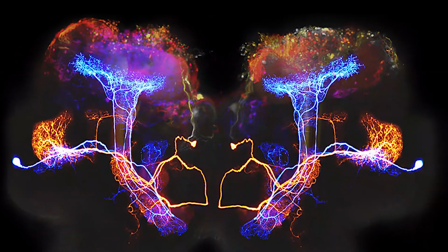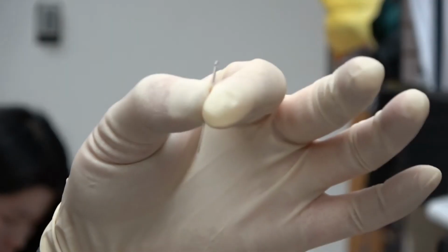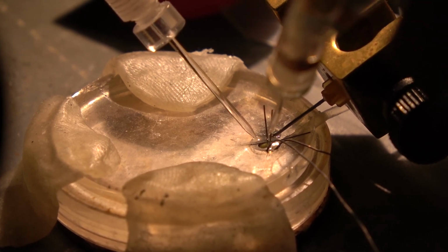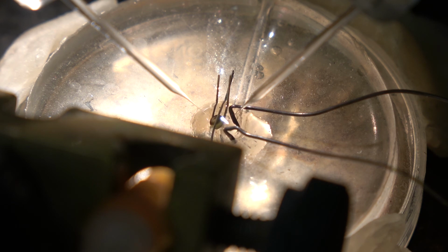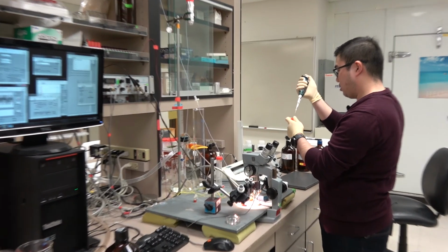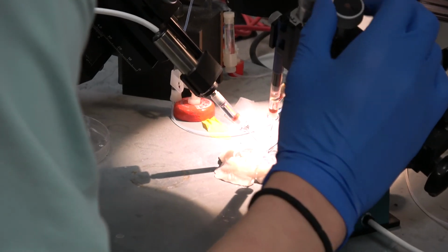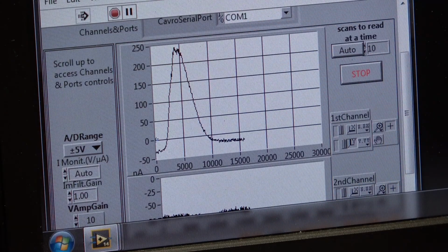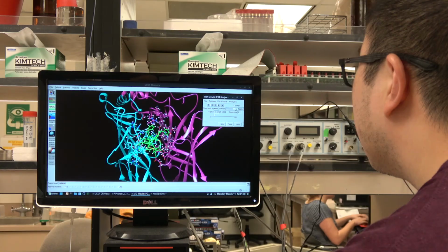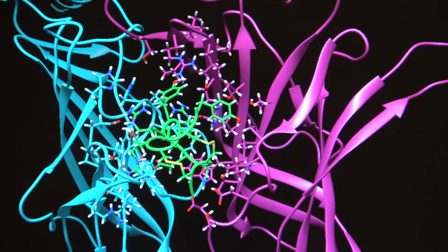Many cells use electrical current to affect their behavior, which he can measure via electrophysiology. He inserts electrical probes into individual cells to measure electrical activity. Normally, the cell will transmit electrical signals when activated, giving Peter a graphical readout. He repeats the process, only this time adding a sample of RG1A to the dish where the cell is being held. He measures electrical current once again, but the reading shows there's no activation, which tells Peter that RG1A has blocked the transmission of a signal. In this case, Peter discovers that the RG1A can block signals that can lead to further nerve damage.